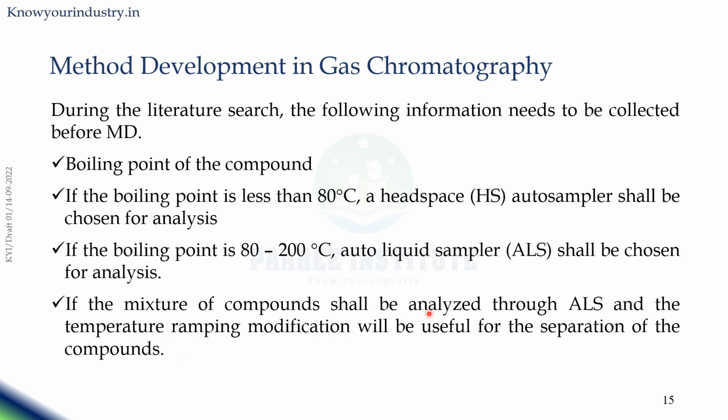If a mixture of compounds will be analyzed through the GC, the temperature ramping modification will be useful for the separation of the compounds. So if there is a mix of several compounds that needs to be analyzed, you can use the temperature ramping modification technique in gas chromatography.